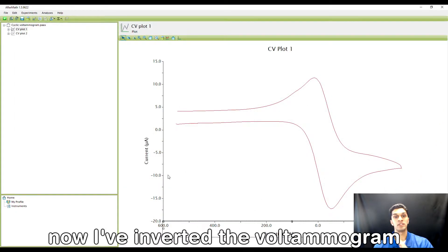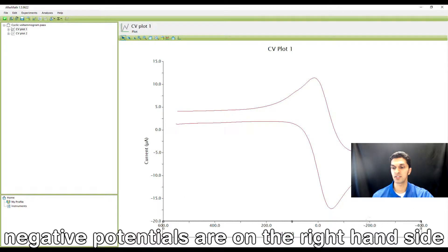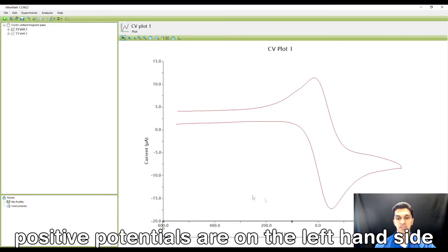Now I've inverted the voltammogram. Negative potentials are on the right-hand side and positive potentials are on the left-hand side.